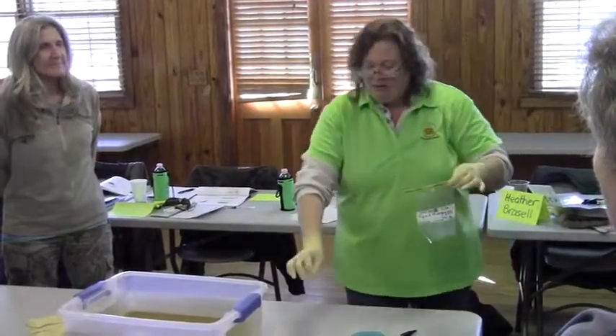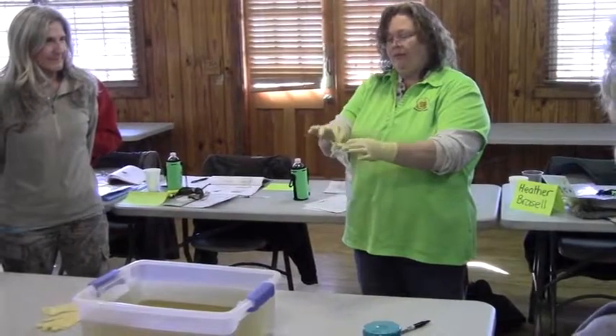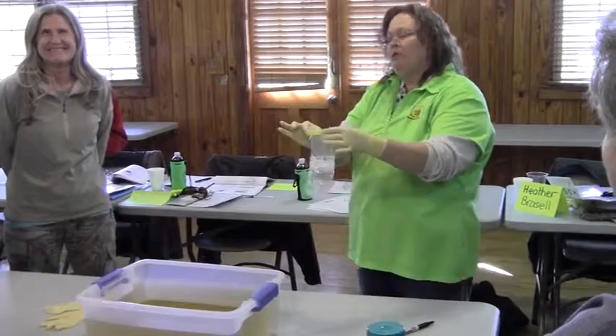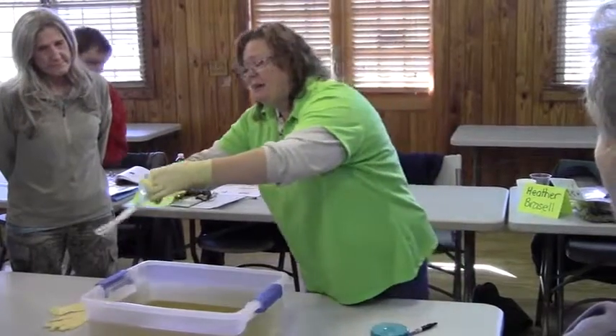Take the top off and put it in our little place. We do not touch the inside of the bag. Do we stick our fingers in there? No, because we need to keep it clean. Now, do we go in and dip it this way, towards us? No.